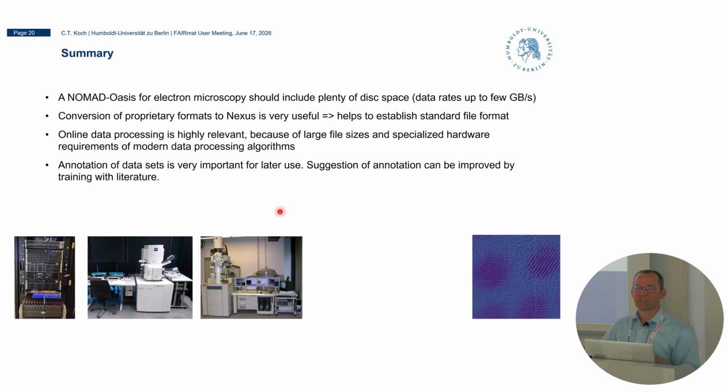And in our field, when you have instruments that are commercially available and also exist in other labs, it really makes sense to first convert to a common data format, because there's one advantage: when enough people do this, you can convince the manufacturers to store in this format as well, and in some cases we've done this already. Then you don't have to worry about this conversion anymore at all, because the data will be natively, without any effort, ingestible into NOMAD. So thank you very much for your attention.